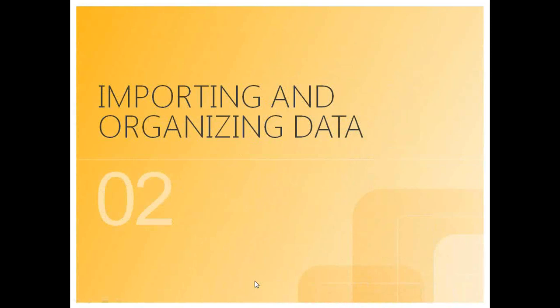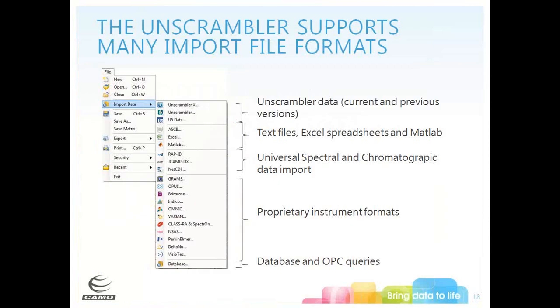Now we want to get into importing and organizing the data we want to work with. The Unscrambler supports many import file formats. Going to File, Import Data, you'll see formats including Unscrambler data formats from current and previous versions, text files, Excel spreadsheets, MATLAB data, universal spectroscopic and chromatographic data formats, and many different proprietary instrument formats.